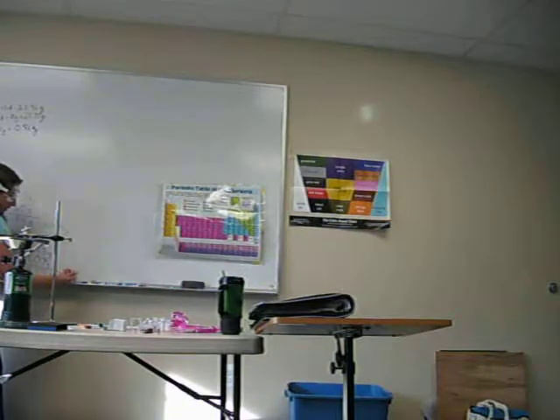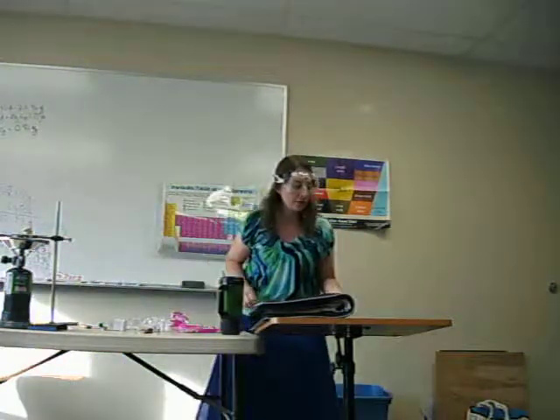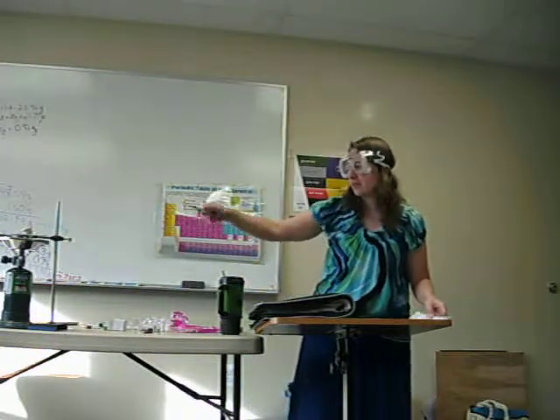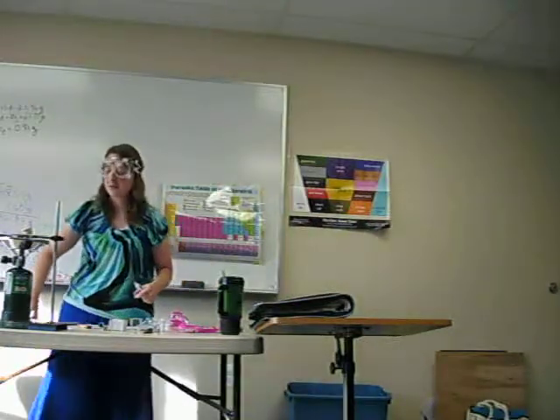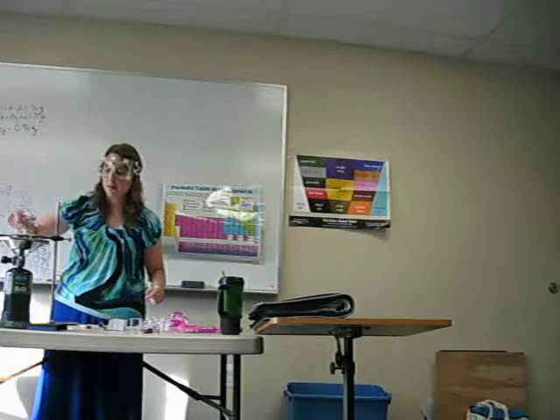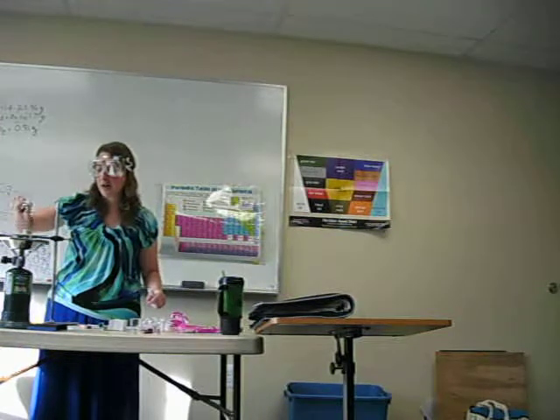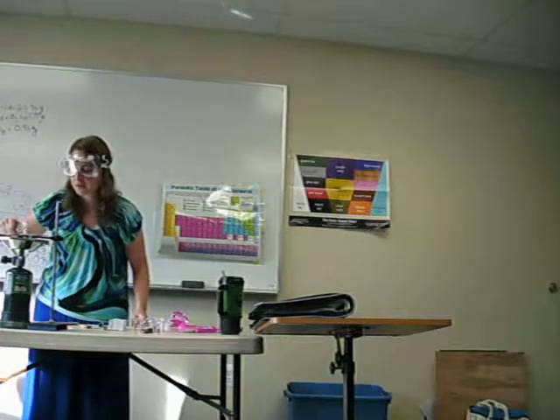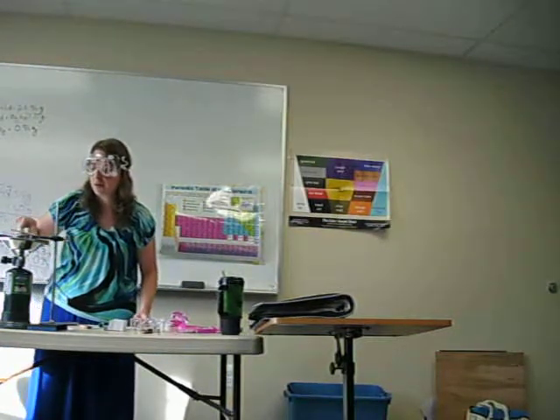Now, this will just show you how to do the math for percent composition. We'll calculate the percent composition of both here. Make sure you've written your procedure steps for that, like oxygen was fanned, or air was fanned into the crucible periodically. And if it goes wrong, of course, you have to record what actually happens, not what we're hoping will happen. We're still smoldering away in there. Oops, I'm going to break the lid.